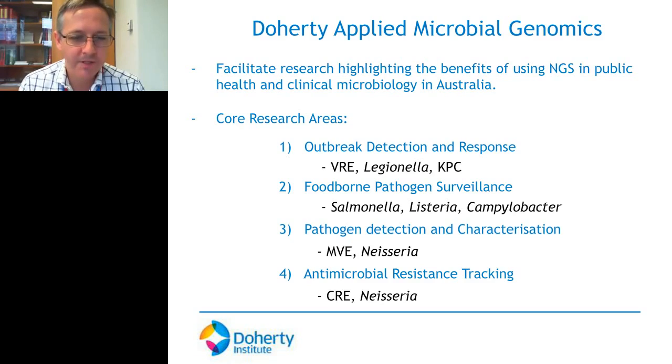And interestingly, once you start doing this, then the interest in the technology and the application of the technology starts to really become very broad. And so quite quickly, we've been asked to look at things like outbreaks of disease, such as VRE or vancomycin-resistant enterococci in hospitals. We've been applying it to Legionella when there's been potential outbreaks of Legionella, and also drug-resistant bacteria such as KPC, Klebsiella pneumoniae, which I'll talk a bit more about in a moment.